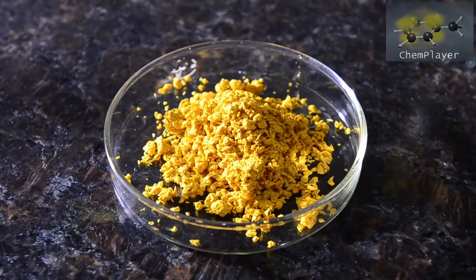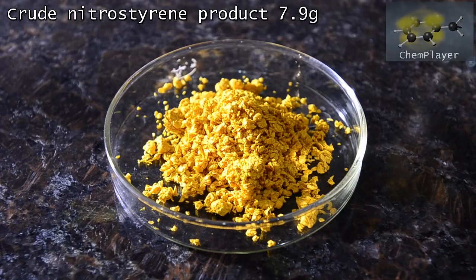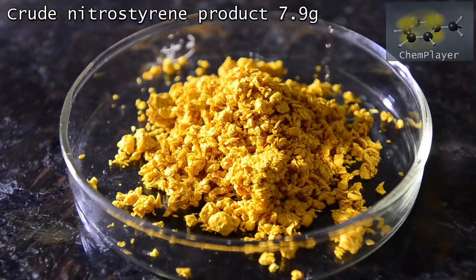Here's our crude product, 7.9 grams of a bright yellow solid with a slightly orange tint. Since the filtrate was bright red in color, it's possible that the orange color is due to impurity. As a crude product, this is a 61% yield on starting vanillin.